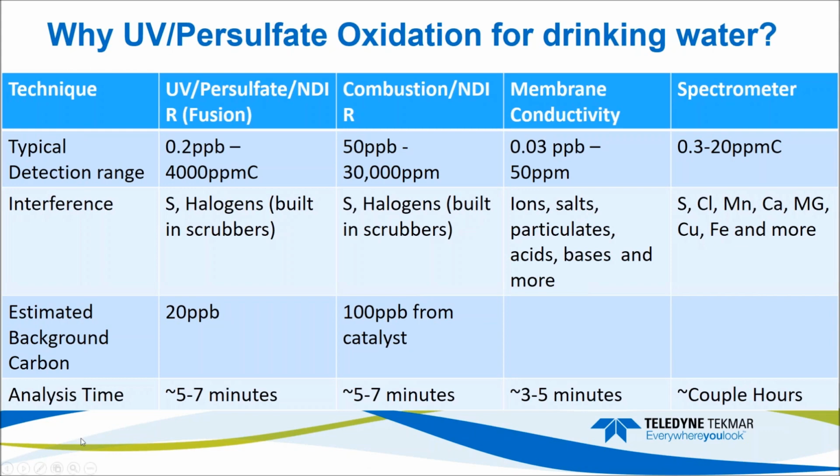And you can see the first three techniques are relatively the same analysis time-wise, except for spectrometry. It takes a couple hours. So it's a big, long process of sample prep and things like that. And then basically at the end, you just see how much the color changes after you do, you know, a titration, that kind of stuff with it. So it takes a long, long time. So that's another reason.